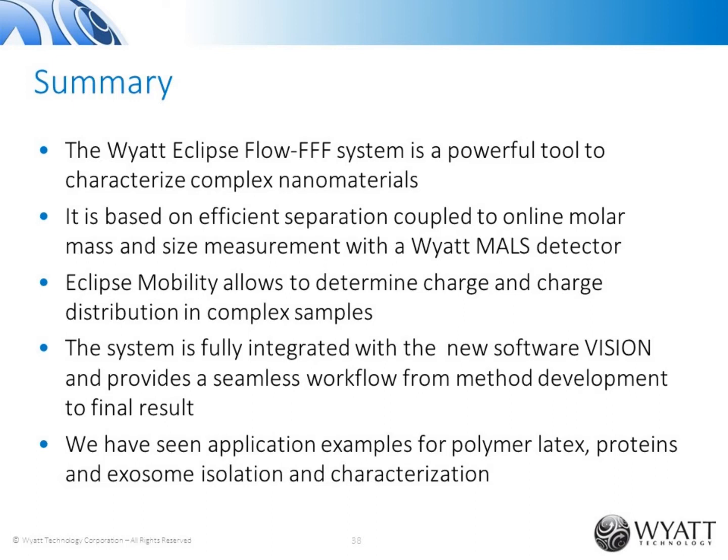Okay. How will the samples need to be processed to inject into the ribbon? Excuse me, can you please repeat it? The question is, how will the samples need to be processed to inject into the ribbon? The sample preparation and processing is like you would have it in field flow fractionation. That means you need a stable suspension or solution of your sample.